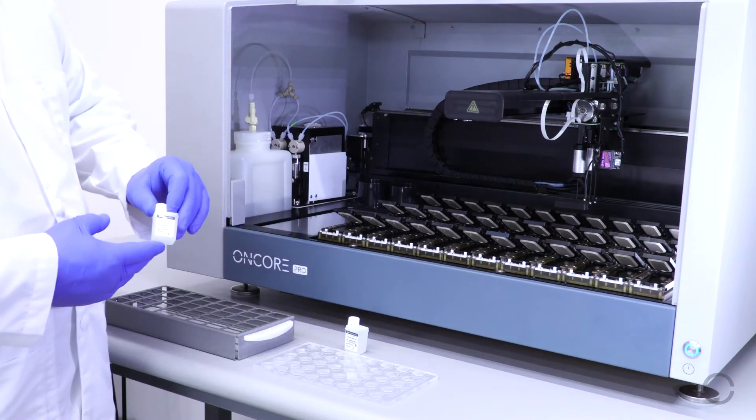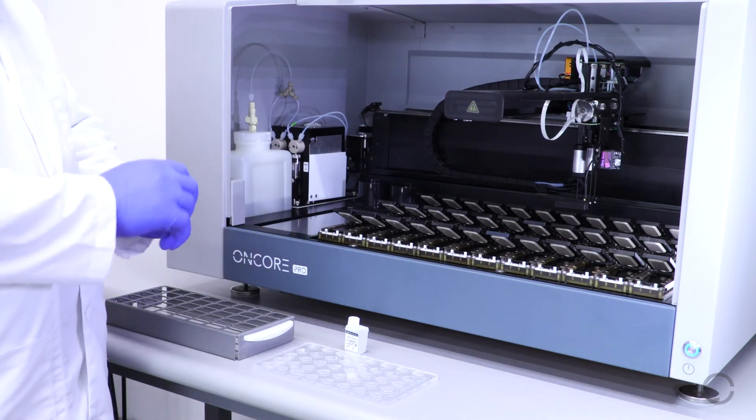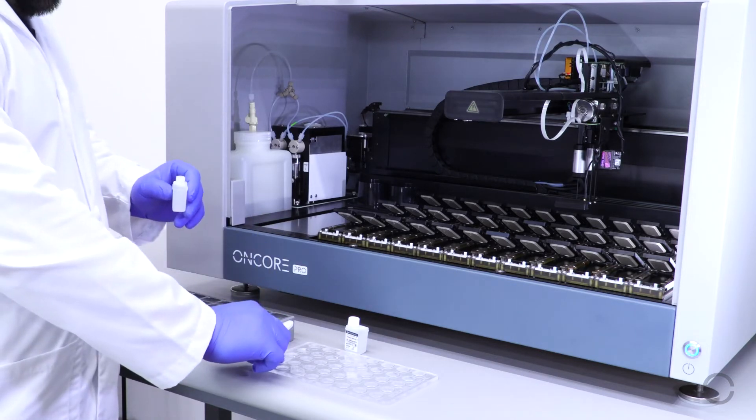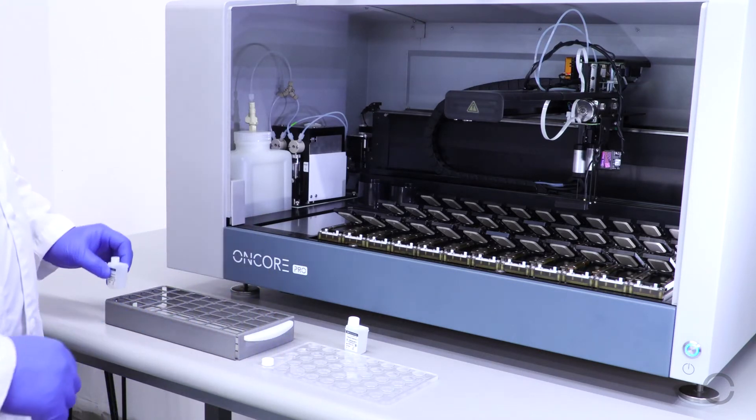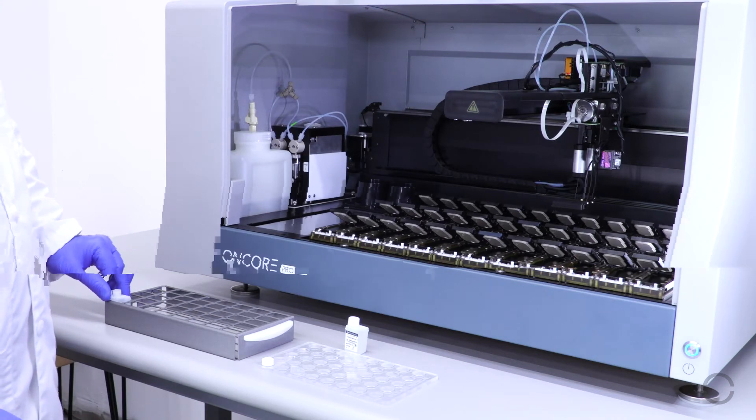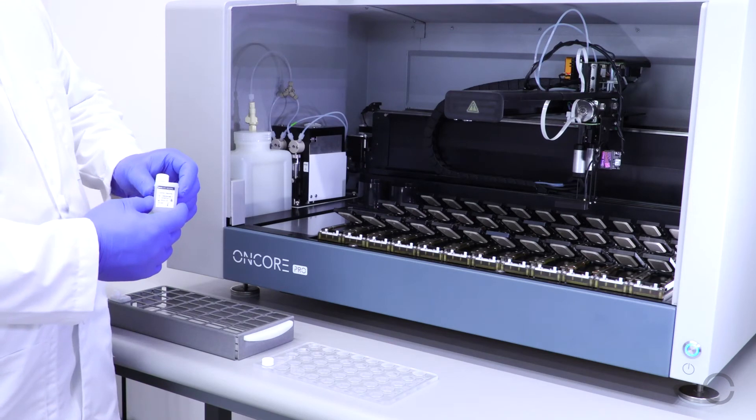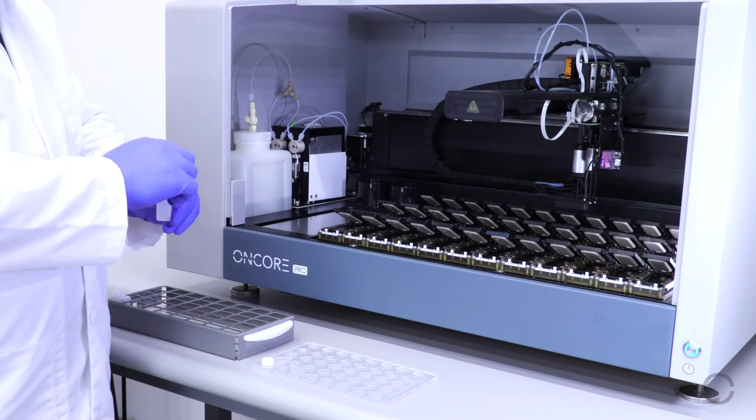Next, take tubing cleaning reagent 2 and load it into position 5 in the reagent tray.